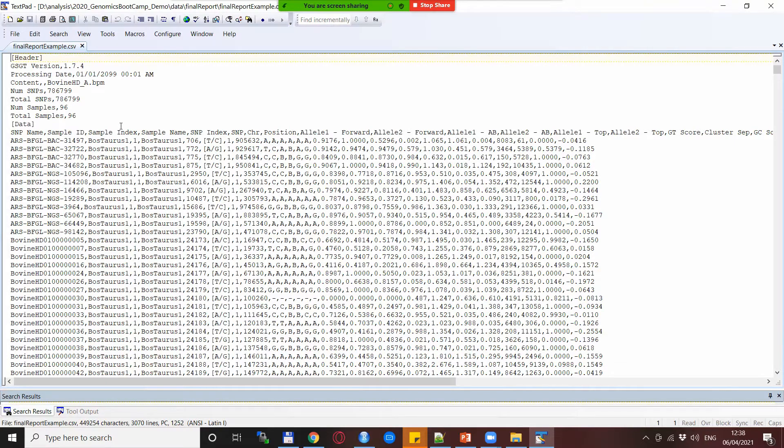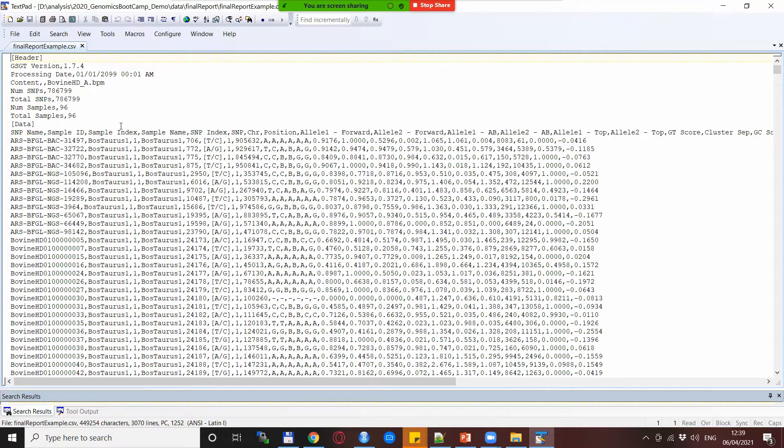Also to fit into the data requirements these are just SNPs from the very beginning of the first chromosome but it fits very well to our purpose to basically talk about the final reports.